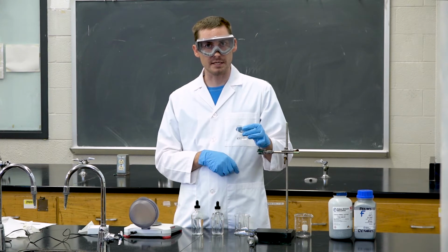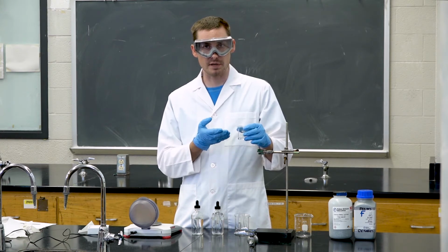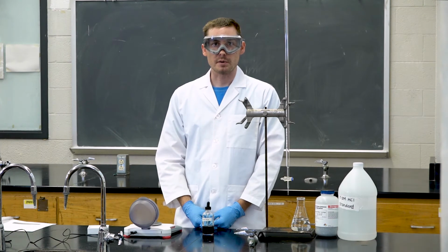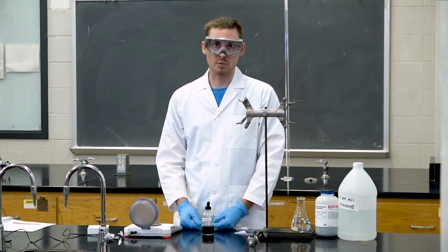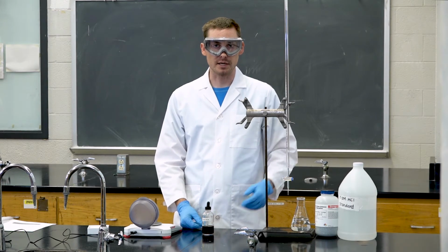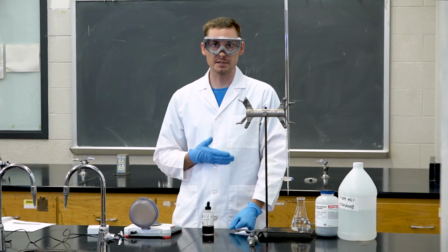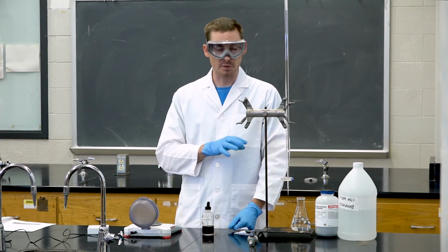The next part will be a titration, where we determine the amount of calcium that we have added to a solution of water. So in this part of the experiment, we're going to be performing an acid-base titration using calcium metal and water. We will first add calcium metal to water in an Erlenmeyer flask, which will react, forming hydrogen gas like before, and also calcium hydroxide. This will be the base.